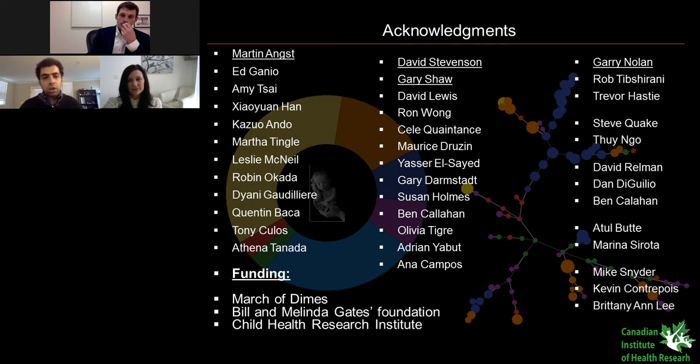But generally, lower dimensional assays like Luminex tend to have higher information content because they are measuring specific biological processes that we understand very well. And as dimensionality increases, we can measure, for example, gene expressions of a large number of genes that all belong to the same pathway and are highly correlated. So mass cytometry falls somewhere between those two extremes. We have to make sure that the pipeline that we use does a good job at capturing that trade-off between number of measurements and information content.